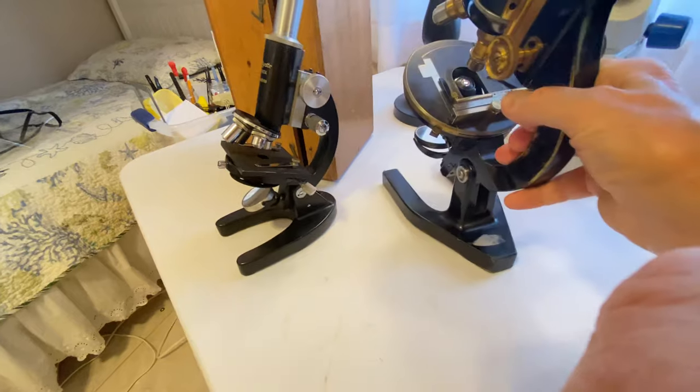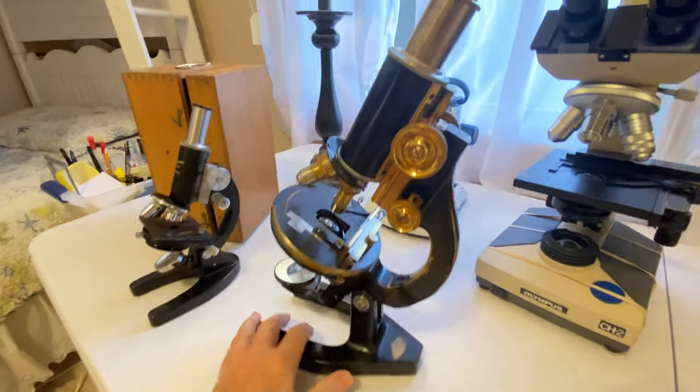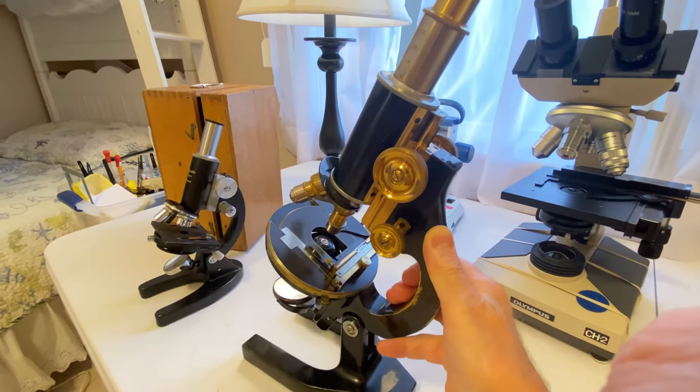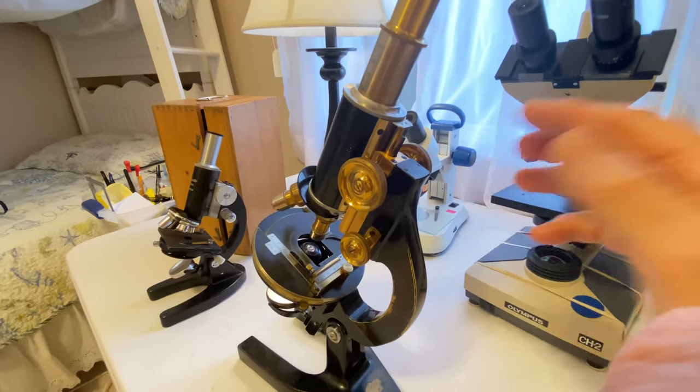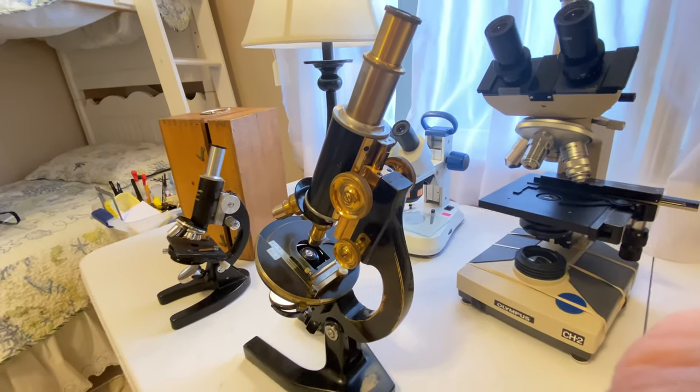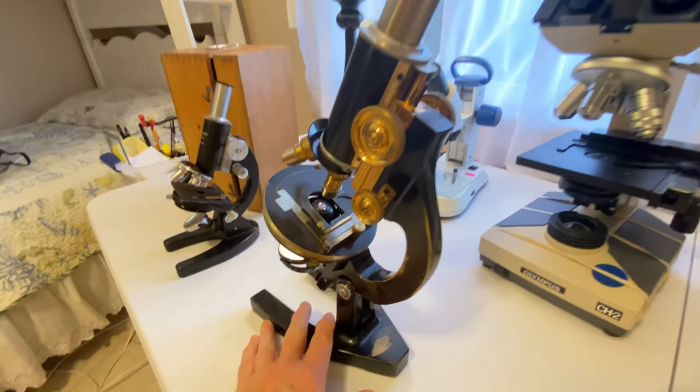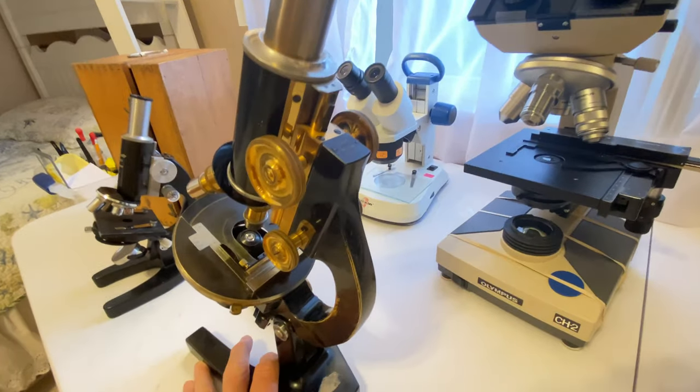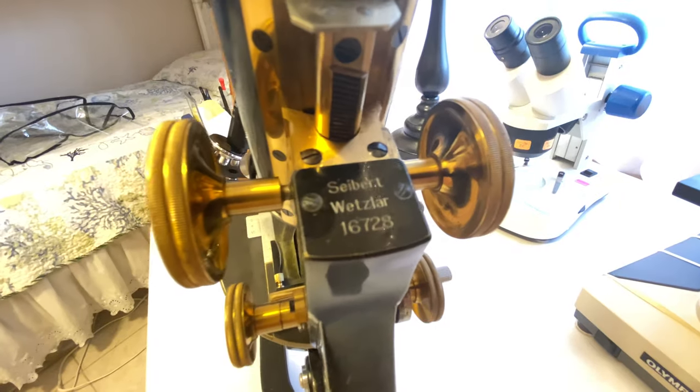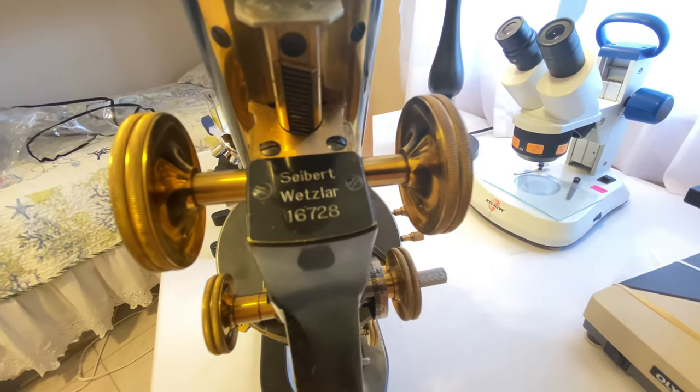And then here we have my piece de resistance. I bought this as a collector's item, actually, just as a conversation piece, because I always wanted to experience a microscope like the famous people from the 19th century, the Pasteurs and the Kochs used. And this is a Siebert Wetzlar. I don't know how old this microscope is. I believe it's anywhere from 1899 to 1910. I have been unsuccessful in being able to determine how old this microscope actually is. If anybody out there can tell me, I would be most appreciative.